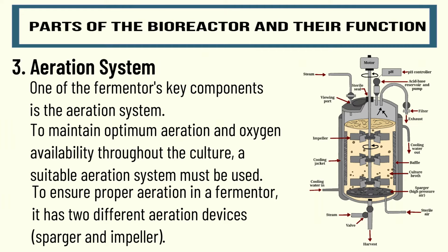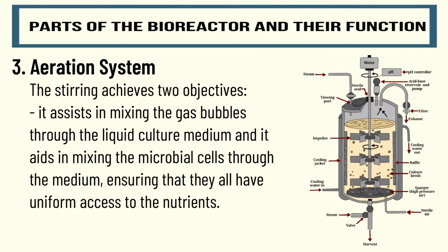The stirring achieves two objectives. It assists in mixing the gas bubbles throughout the liquid culture medium, and it aids in mixing the microbial cells through the medium, ensuring that they all have uniform access to the nutrients.